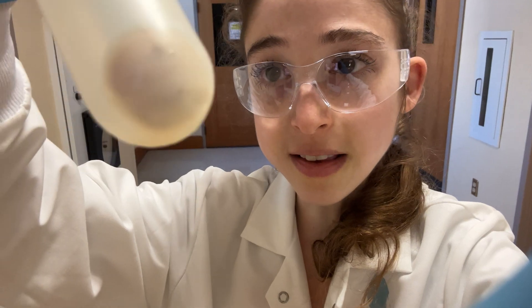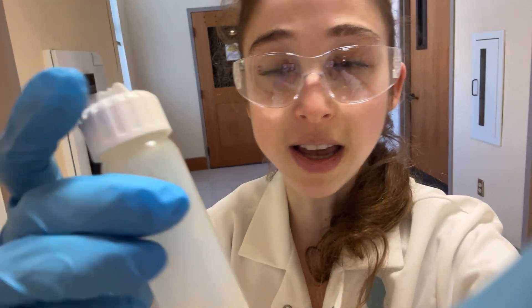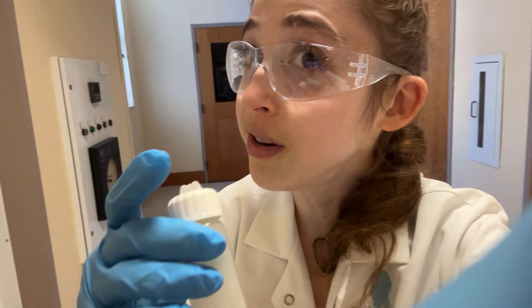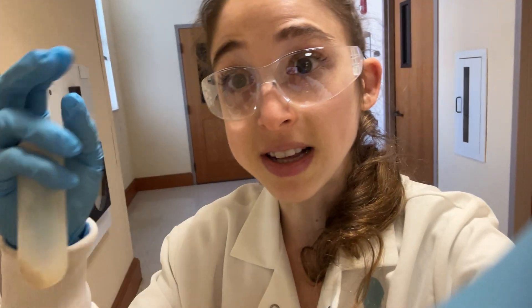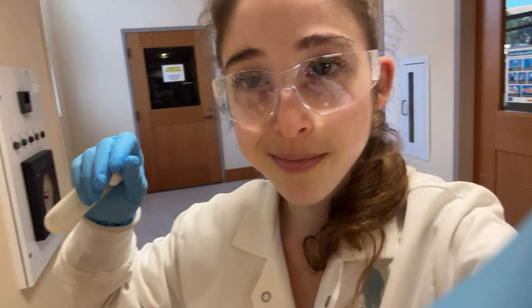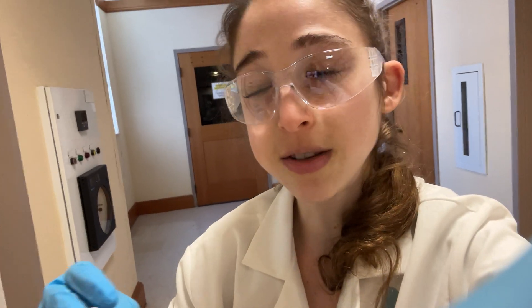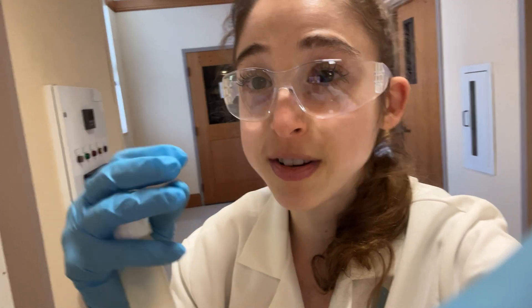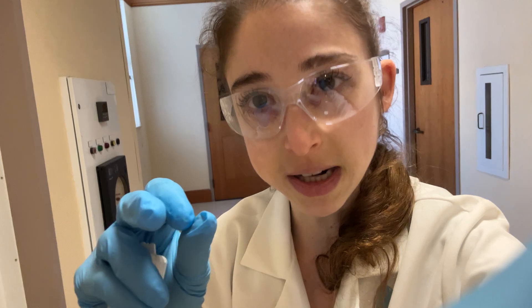You get this pellet that's the membrane gunk, and then there's liquid above it - the cytosolic and liquid stuff that was inside the cell, including, hopefully, our protein. Then we took that solution and put it on the column, and did a bunch of washes.